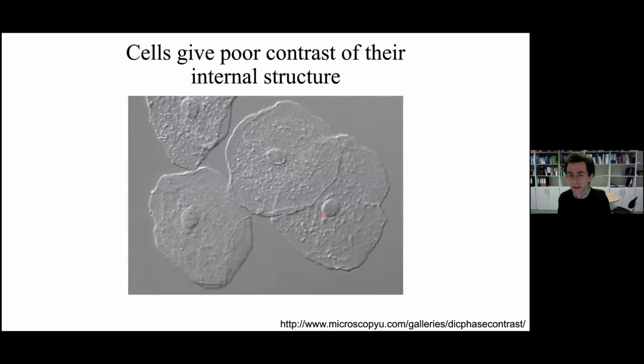You can look at living cells, but what you can see of these living cells, at least at first sight, is not so tremendously exciting, because you can see the features of these cells, you can detect that there is some morphology and some finer texture to the cells. You can, for example, identify the nuclei, and these grainy features here, which are the organelles within the cell, but the ability to make quantitative statements with an optical microscope, with this type of approach, is limited.